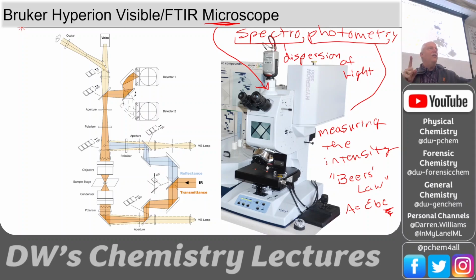Whenever we're measuring the wavelengths, like an infrared spectrum, and we want to say, oh, it's a carbonyl, oh, it's got a CH stretch at 3000, oh, maybe there's something down at 700 wave numbers indicating, I don't know, carbon-carbon bonds or a carbon-chlorine bond or whatever. That's looking at the x-axis, right? So that's the wavelength axis or the wave number axis. That's just spectroscopy. So we're using the spectrometer as a spectroscope. We're looking at the wavelengths. When we're dealing with the y-axis, we're measuring the intensity. We're looking at the number of photons. We're doing Beer's law. That's spectrophotometry.